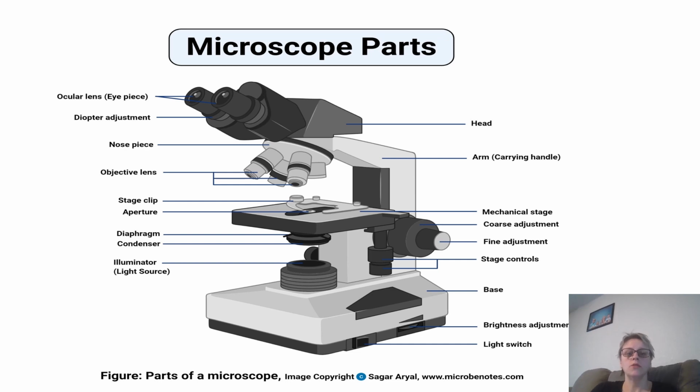And here is a picture of a microscope, some things that you would need to know to use it, to look under, to see the plates and stuff.